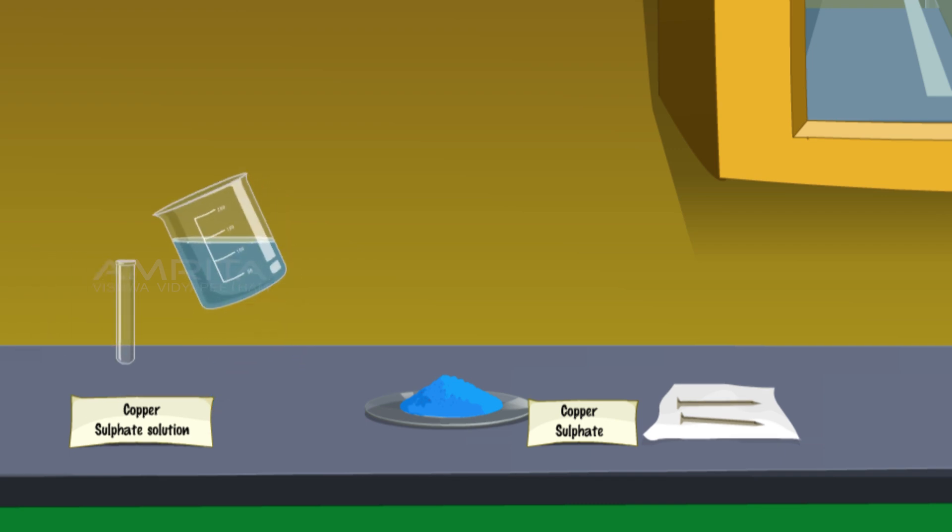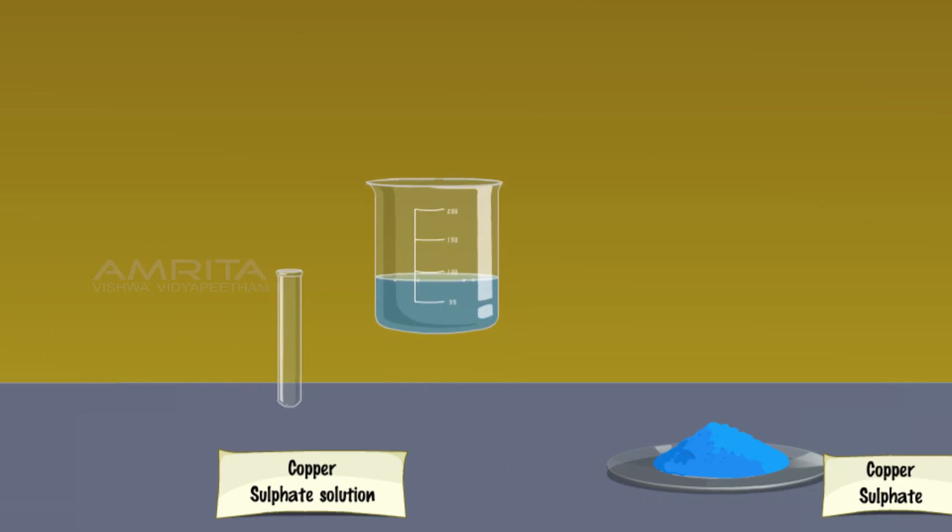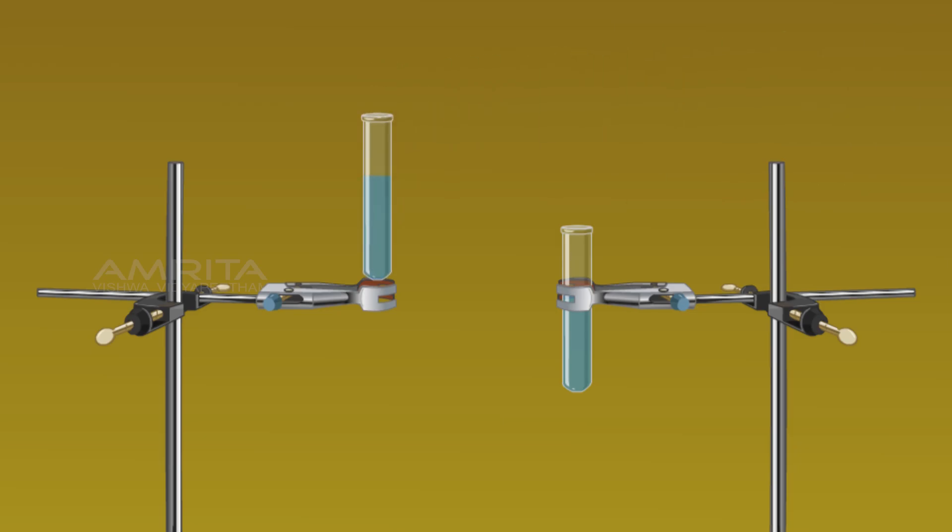Pour sufficient quantity of copper sulphate into a test tube. Clamp the test tube to a stand. Then pour sufficient quantity of copper sulphate into another test tube. Clamp this test tube to another stand.